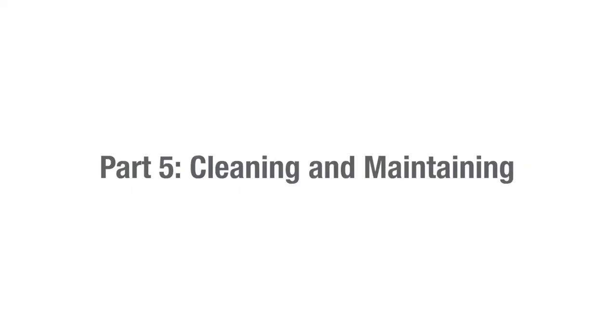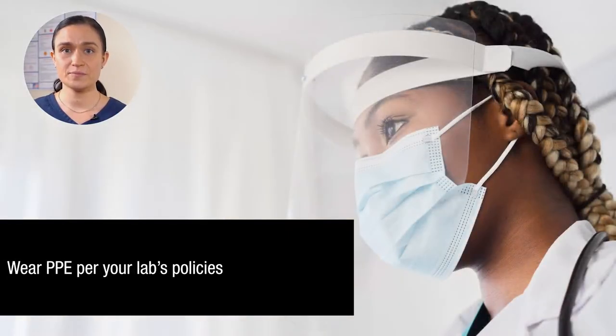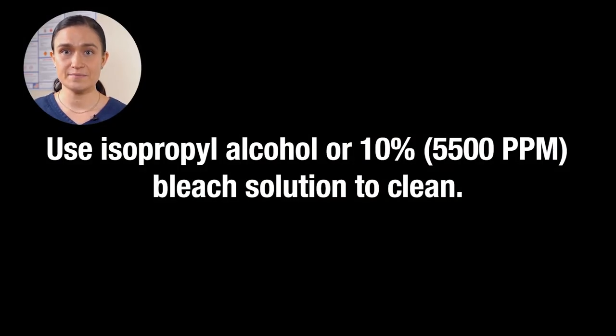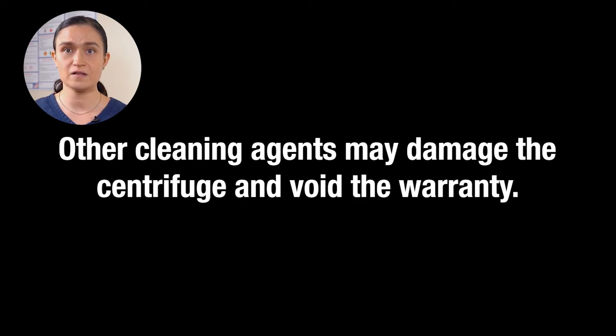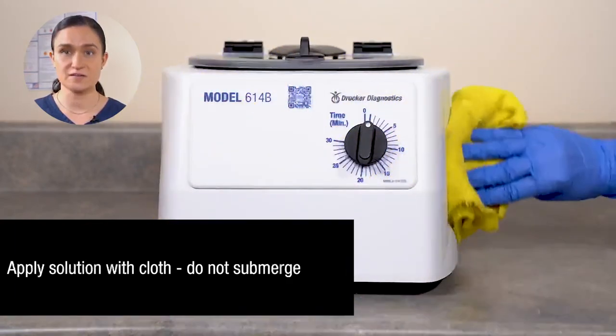And that's all there is to it — you just ran your first cycle. Now let's look at how you should clean and maintain your 614B. Part 5 – Cleaning and Maintaining the 614B. Your 614B requires no regular maintenance. Start by unplugging your 614B from the wall. Make sure to wear appropriate PPE in accordance with your lab's policies. Use isopropyl alcohol or 10% 5500ppm bleach solution to clean. Only these approved solutions should be used — any other substance is not approved and may cause damage to your centrifuge and void the warranty. Apply your isopropyl alcohol or 10% bleach solution with a cloth. Do not submerge the centrifuge in water.